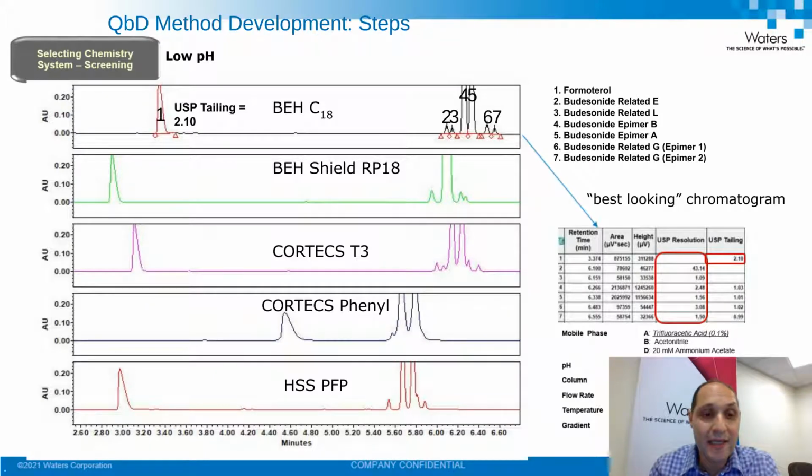So this needs to be addressed if we want to get a high quality method at the end. The other important issue is that a cluster of peaks at the end are not very well resolved. So the end of these results showed us that there is a promise, but there are some issues that need to be addressed to get a final good method.